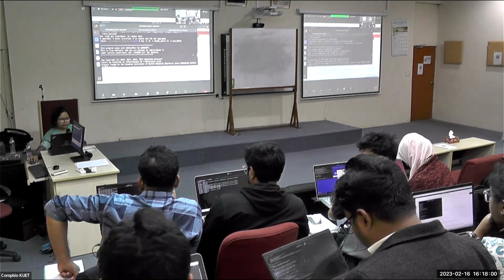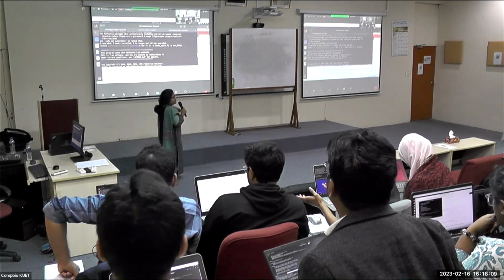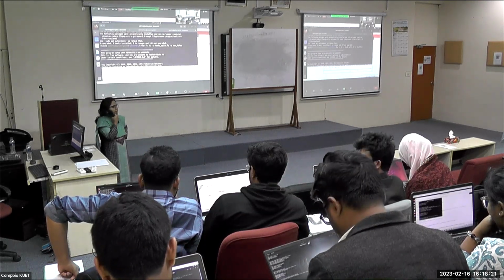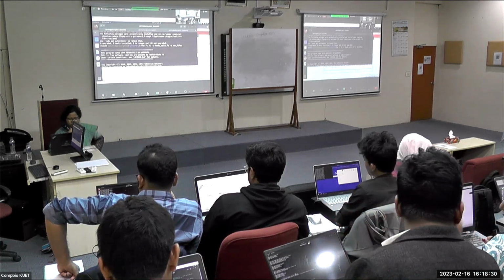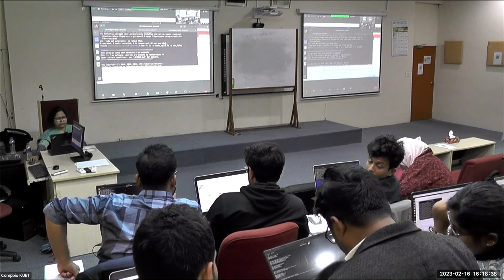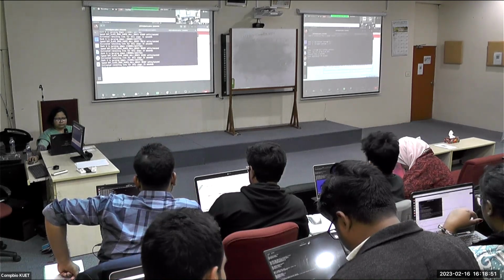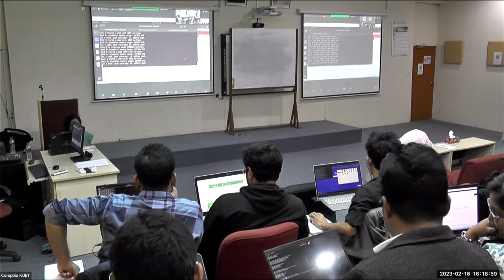So let me show you the command again. It's ray -k31. There is a space between k and 31, and then a space, -s read_split.fa, and -o new mitochondrial ray. This one you can make any folder, and you can name it in any way. You see that it is still working, because it is assembling a genome, so it will take time.